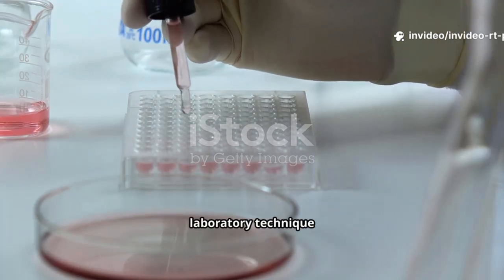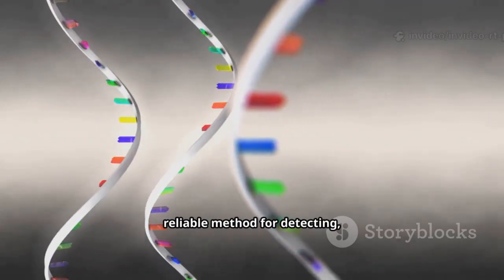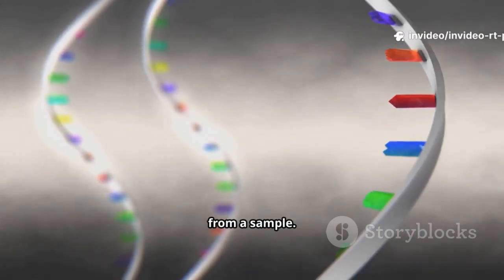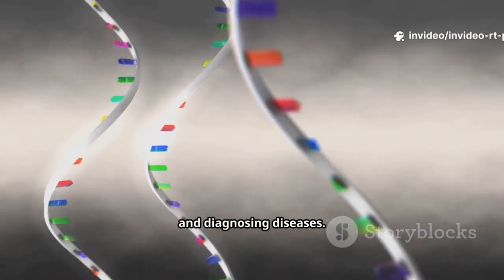RT-PCR is a laboratory technique that stands for Reverse Transcription Polymerase Chain Reaction. It is a highly sensitive and reliable method for detecting, amplifying, and quantifying specific messenger RNA, mRNA, sequences from a sample. This makes it an essential tool for detecting RNA viruses, studying gene expression, and diagnosing diseases.